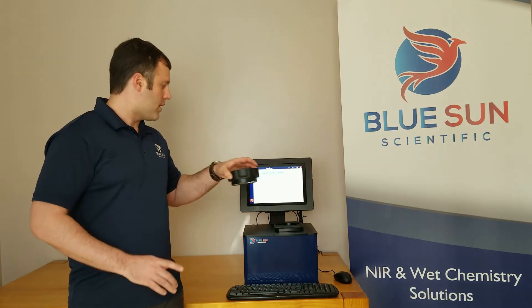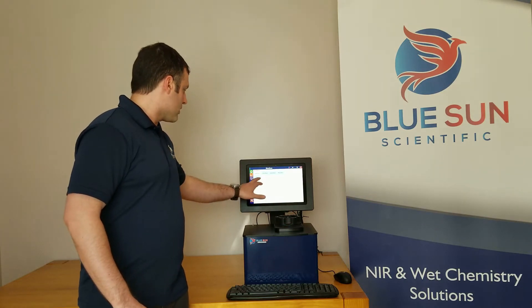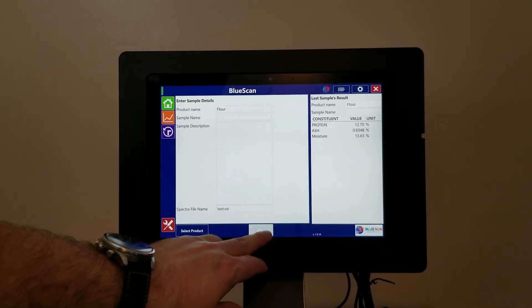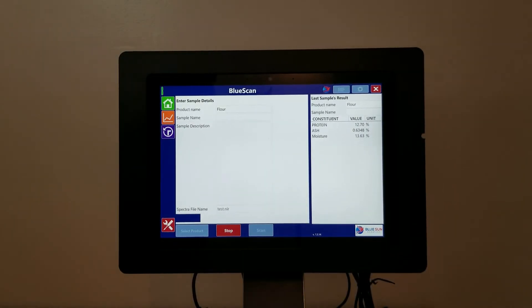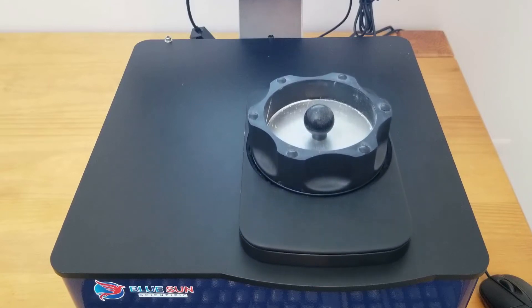After the sample cup has been filled, simply place the cup into the Phoenix's sample card. Select your product using the touch screen and press scan. The Phoenix 5000 will immediately begin scanning your sample. Most analyses take approximately 30 seconds.